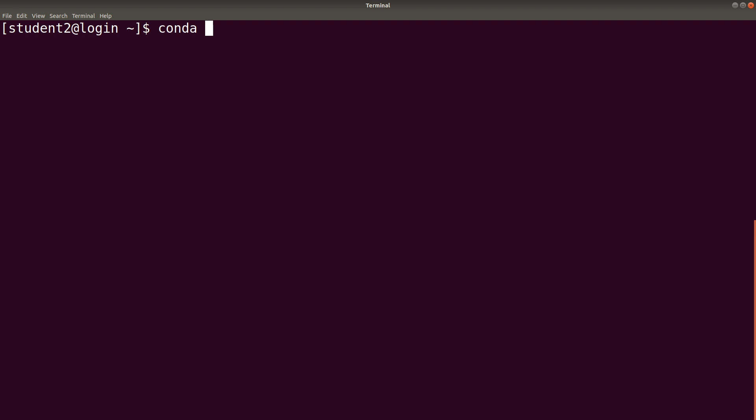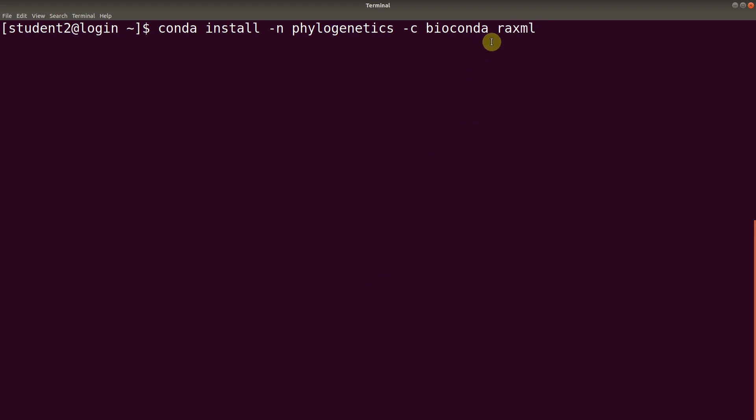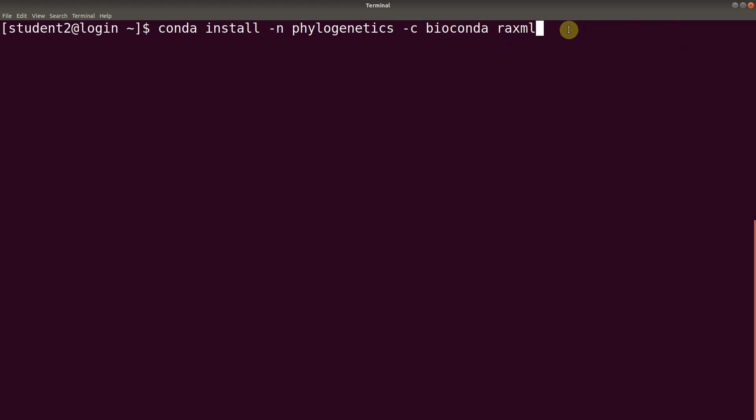Conda install and we indicate the environment name: phylogenetics. And then we indicate the channel, that is -c bioconda. And you indicate the software you want to install. In this case, RAxML. Now, there are times where this can be omitted and the program will still run. So, you can just experiment to see how it works out. But we are going to use this entire line for it. So, let's execute it.